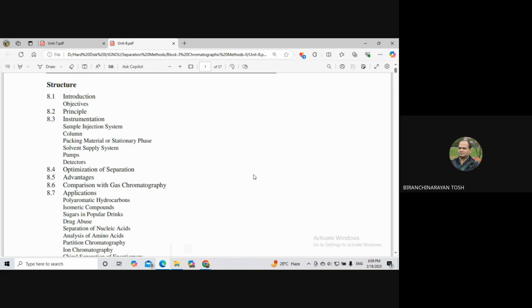This is high pressure liquid chromatography or high performance liquid chromatography. To distinguish from old procedure, modern HPLC has emerged from the confluence of need, the human desire to minimize work, technological capability, and the theory to guide development along rational lines.